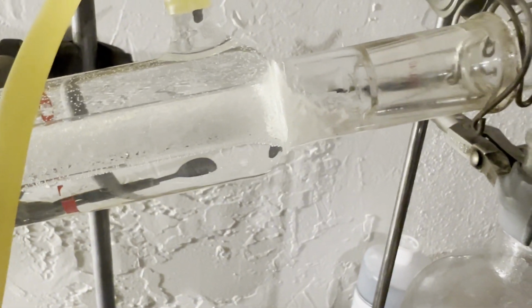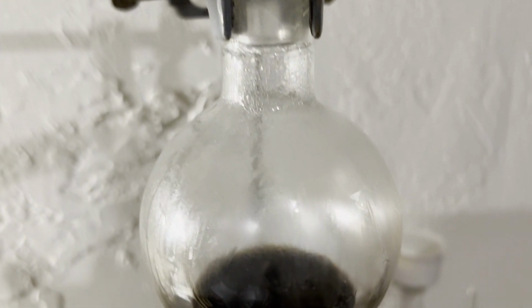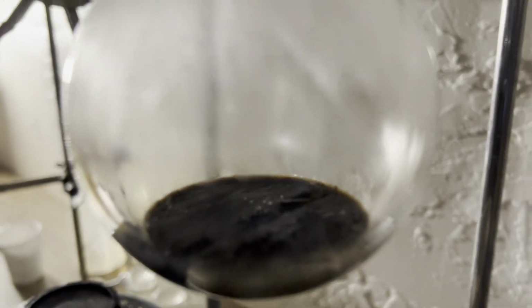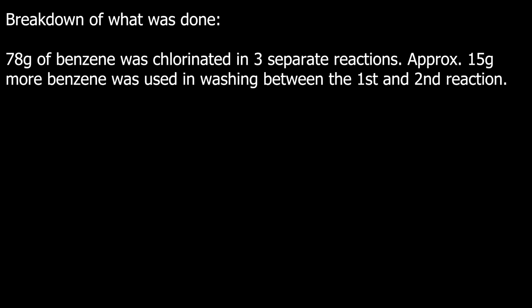However, ODCB is a liquid at room temperature, so is MDCB, and PDCB is a solid at room temperature, as you can see by all the crystals that clogged in the condenser. So it was easily removed by washing it out with DCM. Now some ODCB did stick to the p-dichlorobenzene, but there's an easy way to purify it and I'll mention it in a second. But at this point, my entire lab area smelled like straight up urinal cakes, and it took like a week for the smell to completely go away.